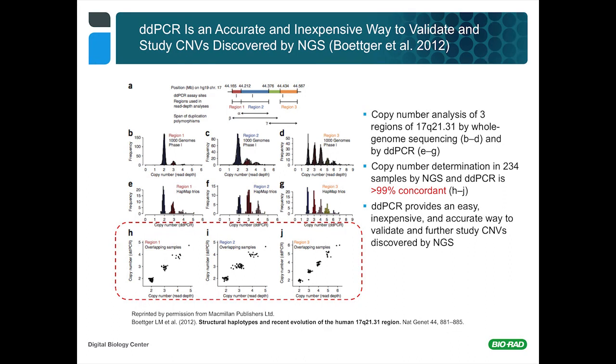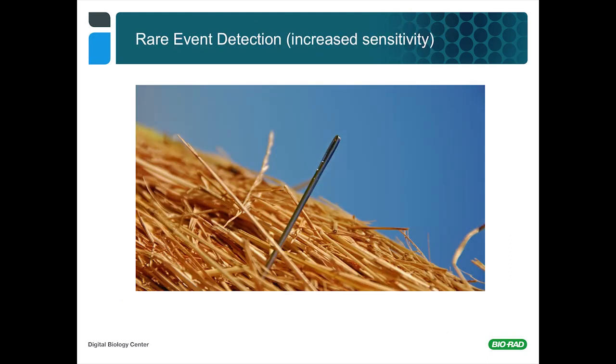So this capability of getting rapid and very precise copy number measurements has been extremely valuable to the McCarroll lab in being able to rapidly score populations for multi-allelic loci that occur not just in this interval, but actually across the entire human genome with many biologically important loci, some known and some to be discovered there. So this will remain a very important tool for discovery and association of copy number alleles.